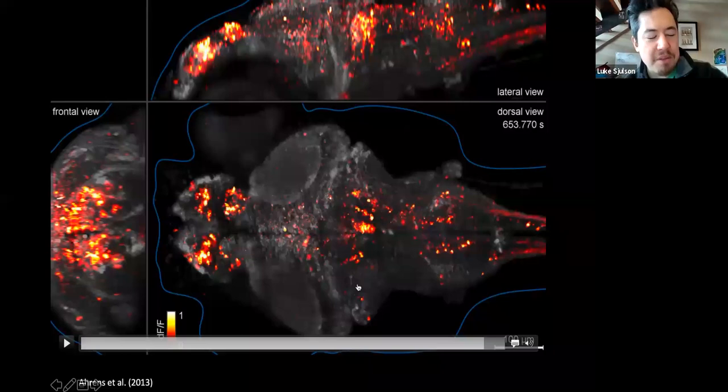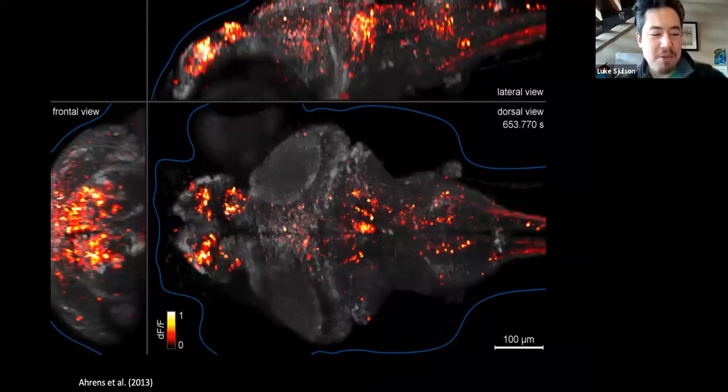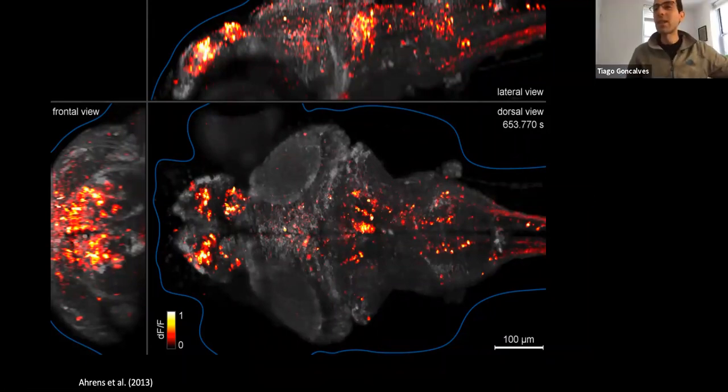One thing, Tiago, people use light sheet for clarified mouse brains. In vivo might not be useful, but in practice, probably a lot of people are going to use it. Right, I forgot to say that. It's very useful for mice, but it's really dead mice that you can image. You cannot do that very easily with living mice.